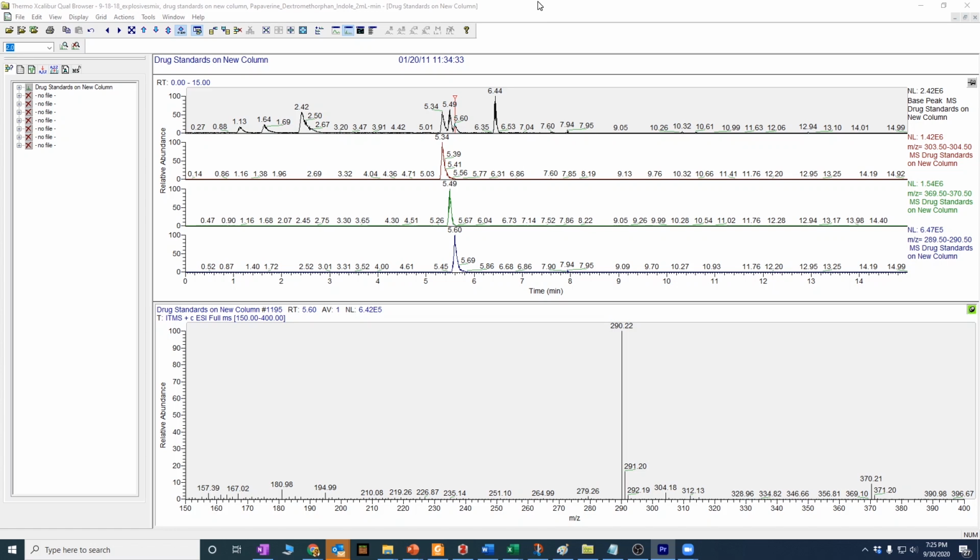So the downside of the mass spectrometer, we're going to get more into that in mass spectrometry. They're expensive. That's one of the things that keeps them out of a lot of crime labs is LCMS. The mass spectrometers that go with LCMS are more expensive than the mass spectrometers that go with GCMS. Another thing is that it depends on the kind of mass spectrometer you're using, but for the most part, just like with UV, if you don't have amines, carboxylic acids, things that can have charge, so amines accept protons really easily. So they work really well for this kind of mass spectrometry.